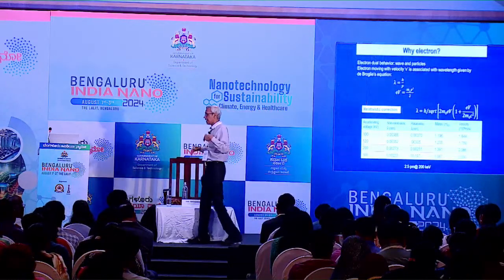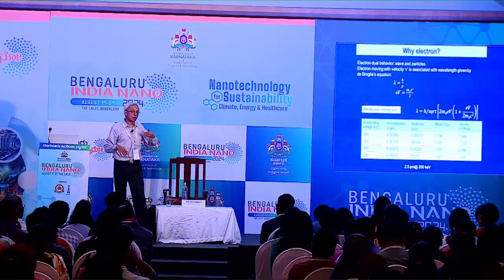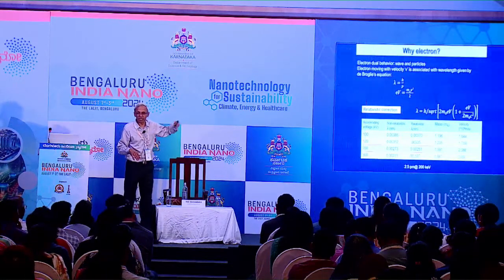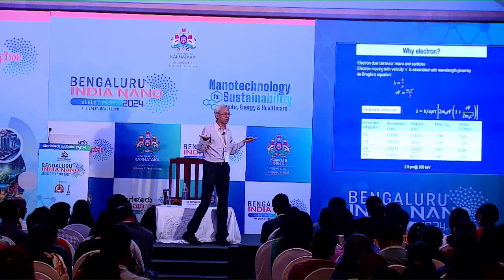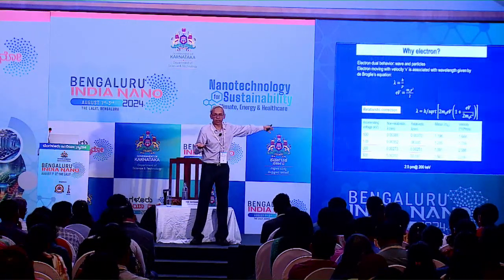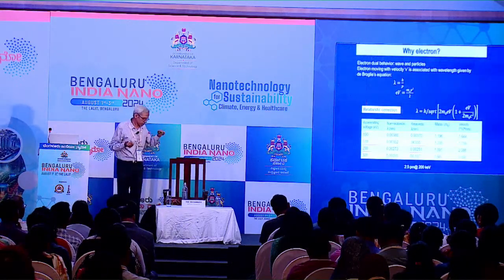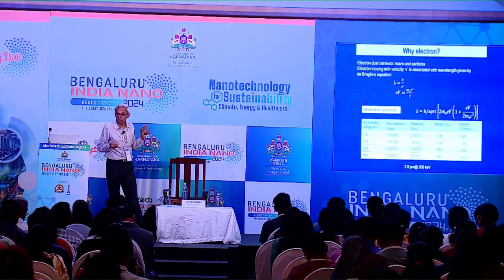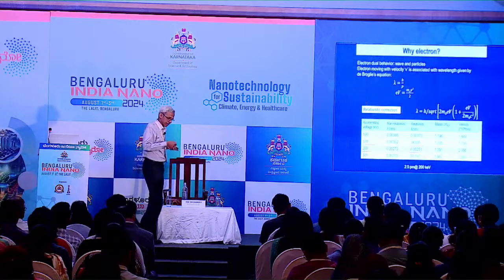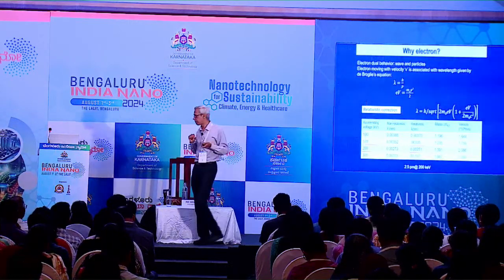Therefore, even though we have a very, very small lambda, it is not possible to get resolution comparable to this. Unlike visible light, where 0.5 micron roughly gave you about a micron of resolution, we get nowhere near 0.025 angstroms. The state of the art currently is roughly of the order of 0.5 angstroms or so. That's still extremely good, but the problem is that the lenses are very, very bad. So that is the key point.